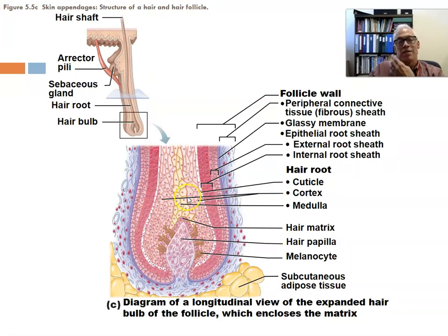Another appendage of the skin is the hair or hair follicles. The hair follicle is a factory to produce the flexible hair stalk or shaft. And if we home in on the hair bulb, the part of the follicle where the hair is growing, we see a layer of cells analogous to the basal layer of the epidermis. Incidentally, this is a modification of the epidermis. You can see that it kind of flows right from the epidermis. So anyway, the basal layer is recapitulated here, and there are stem cells and transit amplifying cells here in the hair matrix, which is again also analogous to the nail matrix.